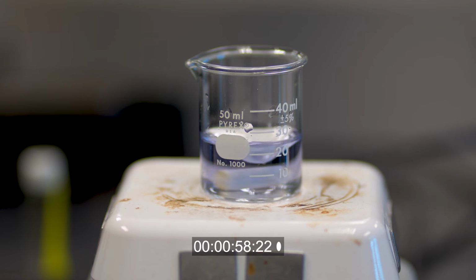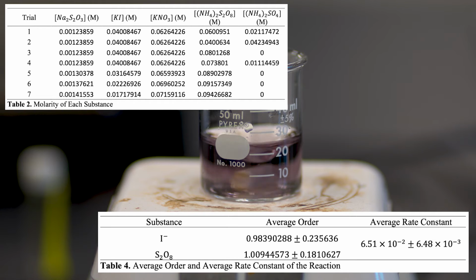It was observed that the concentration of either potassium iodide or ammonium persulfate had a linear relationship with the reaction rate. As shown in the table, the reaction rate in trial 3 was double that of trial 2 when the concentration of ammonium persulfate was increased. This suggested that each reactant is first order.